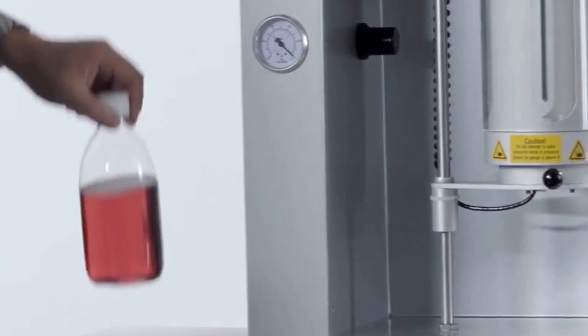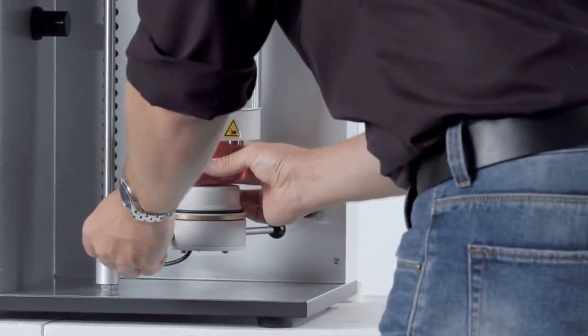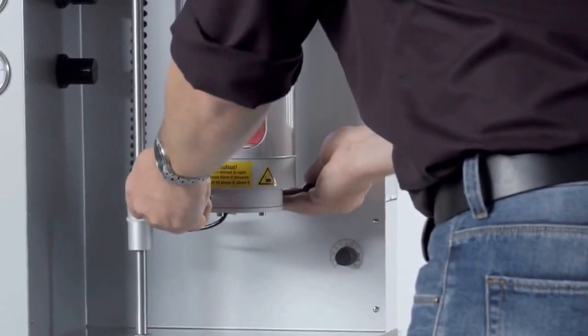It is the ideal measuring instrument for all types of oils including hydraulic oil, gearbox oil, lubricating oil, water and water glycol.